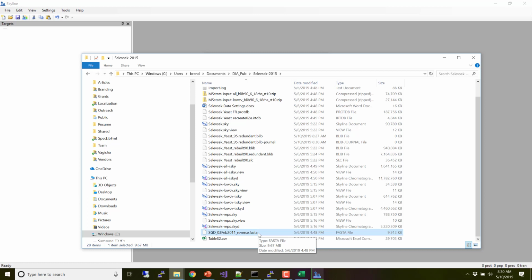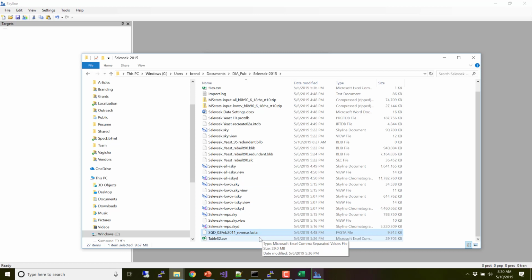And if you read the paper, it's reported as being the February 3rd, 2011 SGD FASTA file. Great. Okay, I went and found that, and there are actually 4 different variants that are possible, and things didn't quite match up. And then I realized, well, I'm not even sure what reverse they use.